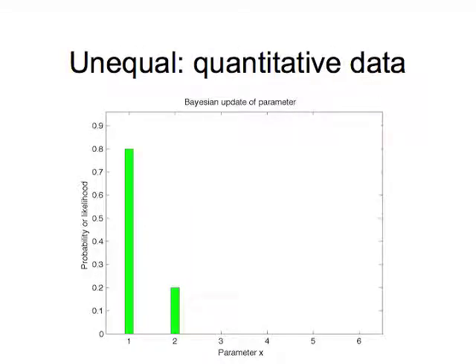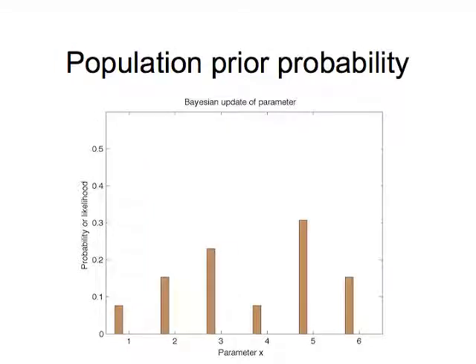Next slide. One can also use quantitative methods that make use of peak heights, such as statistical computer interpretation. And now we no longer have a list of equally weighted allele pairs, but now the weighting of those allele pairs is determined by the data and are no longer the same. Next slide. Let's go through some examples with these three likelihood functions and see where we get, starting with the same prior probability.